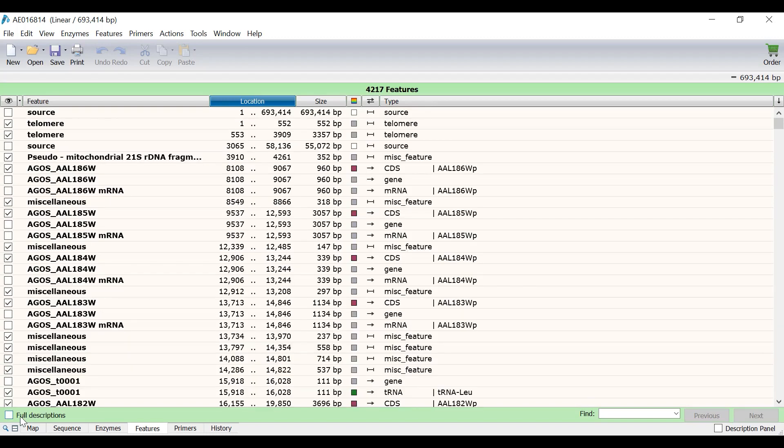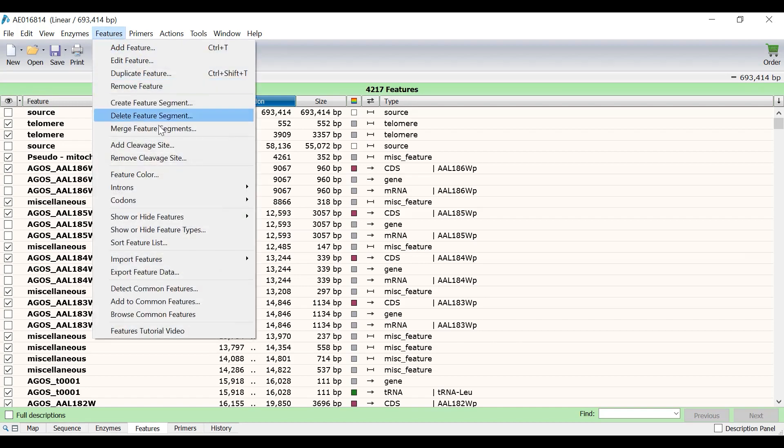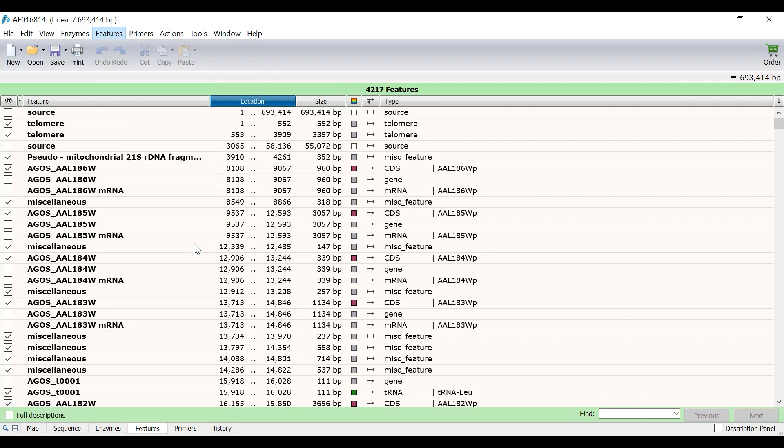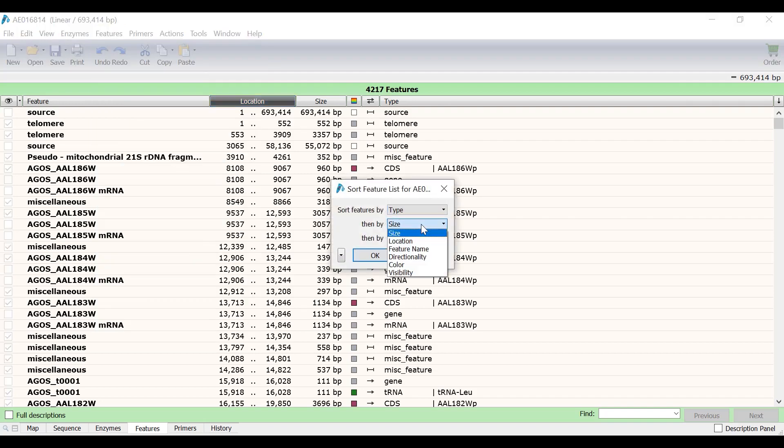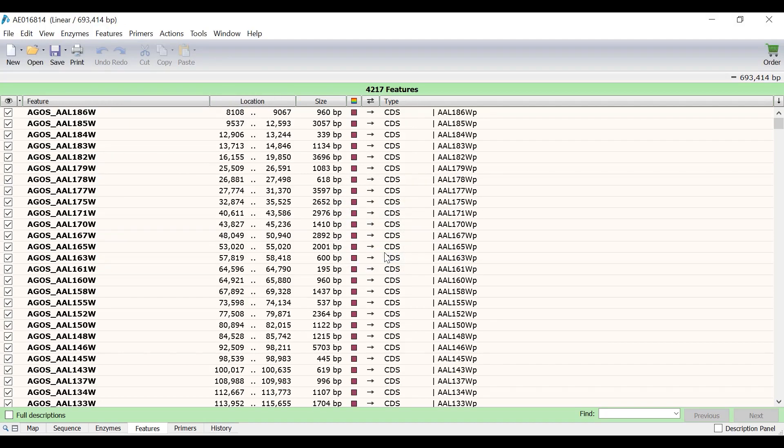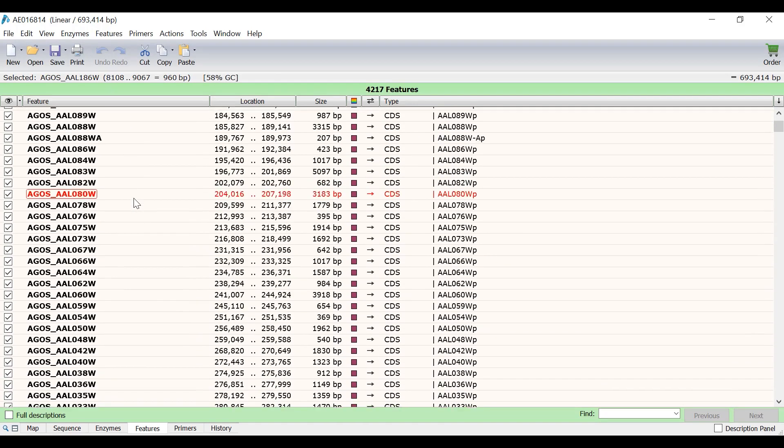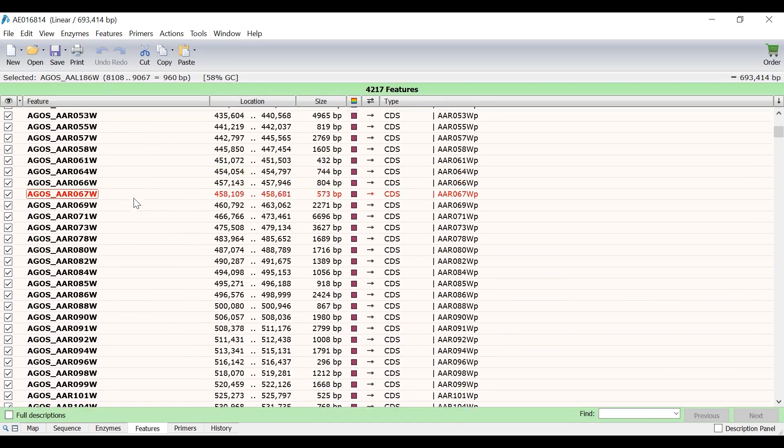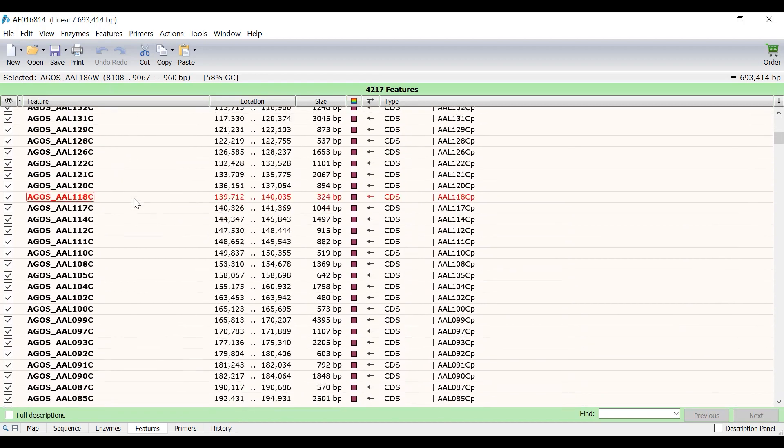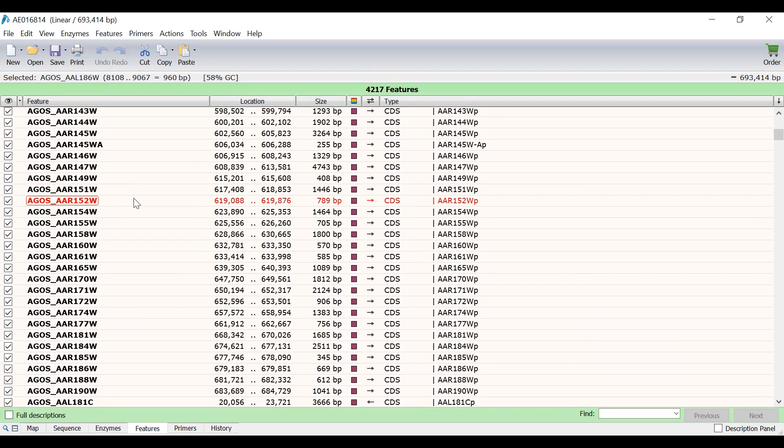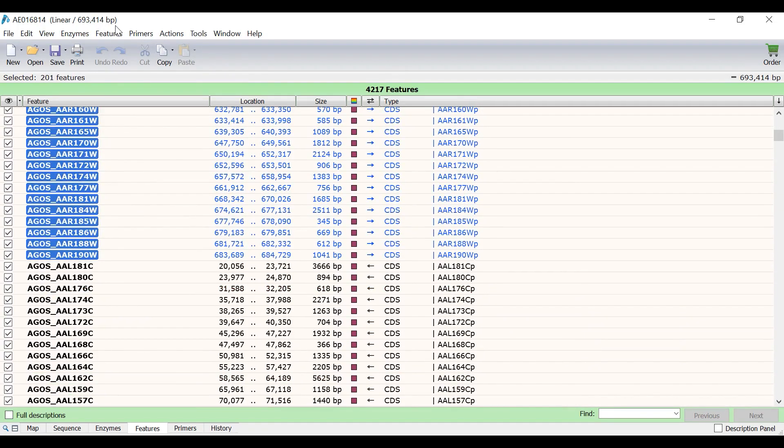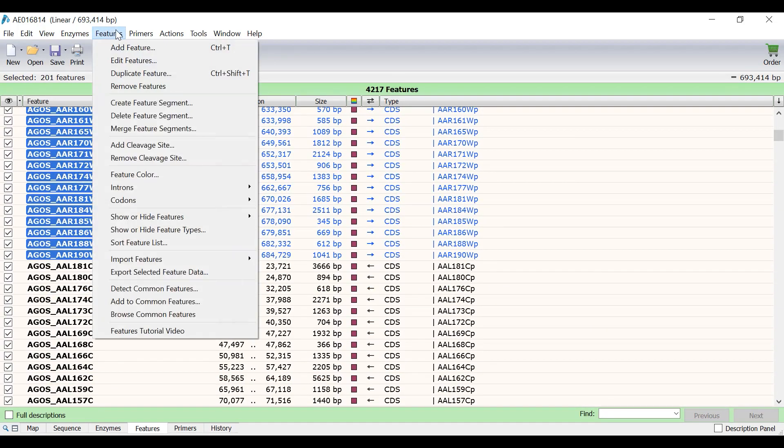What I would like to do now is to change the colour of all of the coding sequence features that are in the forward direction to red, and those that are in the reverse direction to blue. To do this, I will firstly sort the list of features by going to Features, Sort Feature List. I will sort the list by Type and then by Directionality and click OK. With the list now sorted, I will click on the first feature and shift click on the last coding sequence in the forward direction. Now, I will go to Features, Feature Color and select Red.